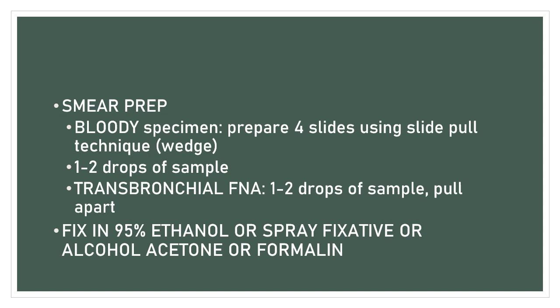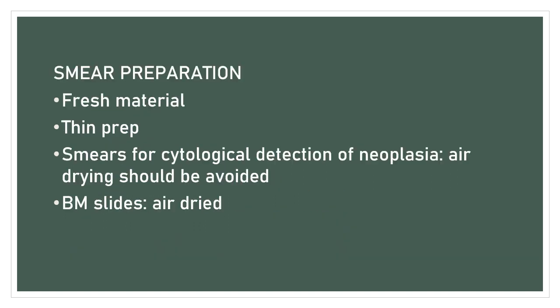So that is for your smear preparation of FNA. Now, the smear preparation for exfoliative cytology. The sample should be fresh material.